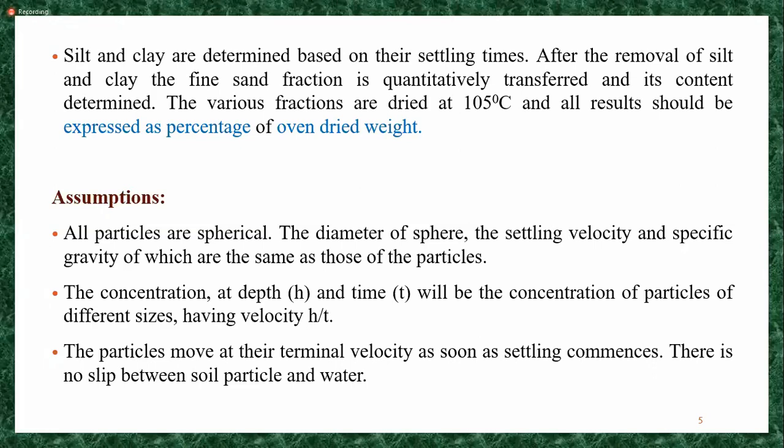You can see the slide and tell me. Yeah, no, any Brownian motion. Absolutely correct. Okay.